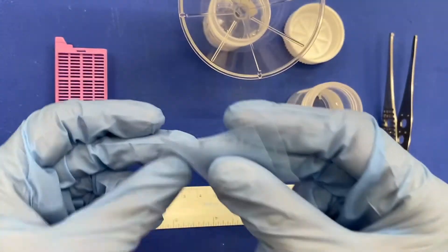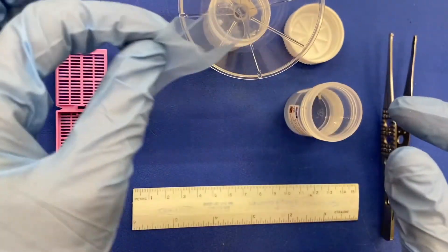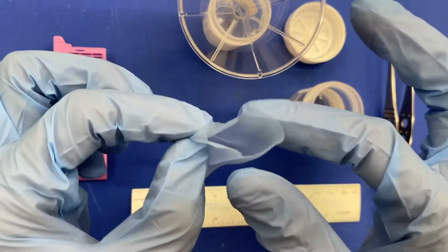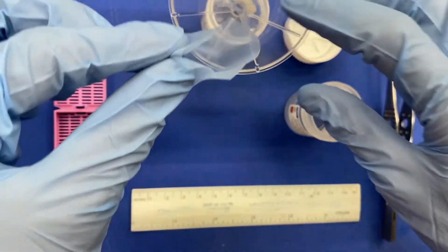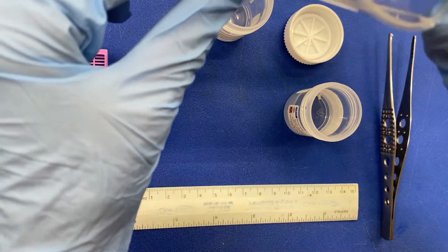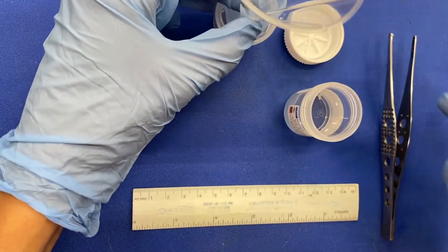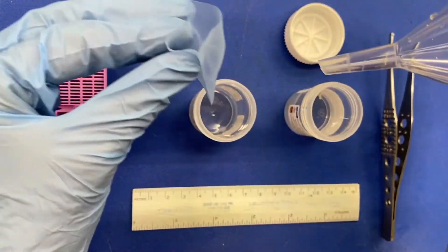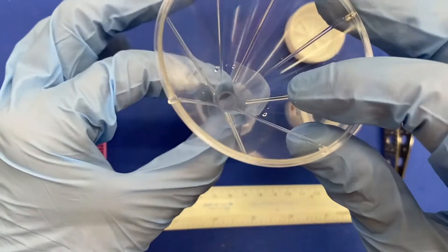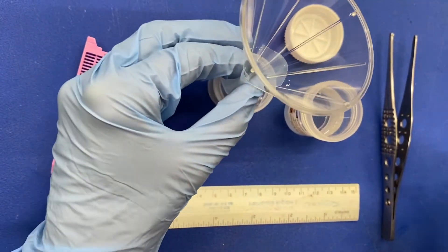You will want to separate the biopsy bag and open it. Hold it in your non-dominant hand and place the funnel inside the bag and over the empty container. Take the biopsy bag, place the funnel within it, and then place the funnel inside the empty container.